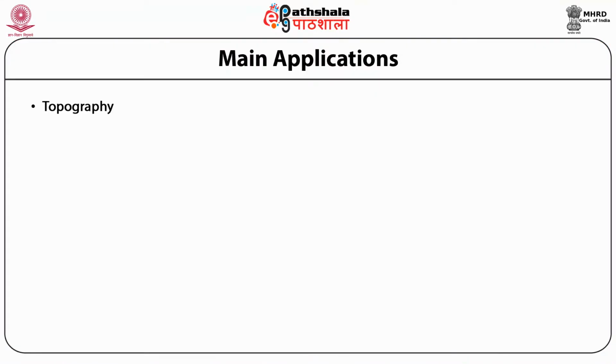The main applications of SEM. We have categorized the main applications into four categories.